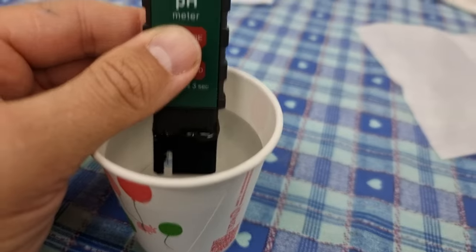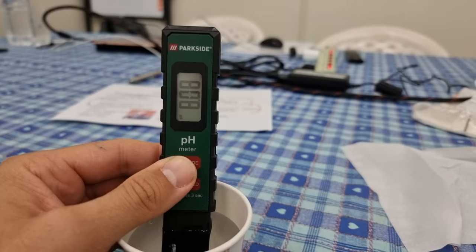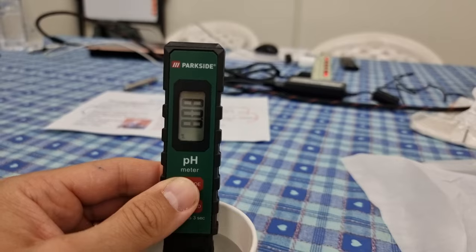I am looking here at the pH of some of the water extracted from Benjamin Huang et al.'s LENA reactor, and it's settled around about 8.08 pH.